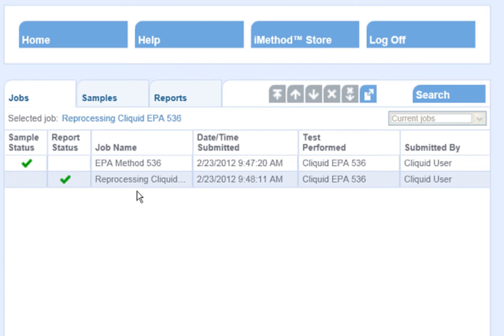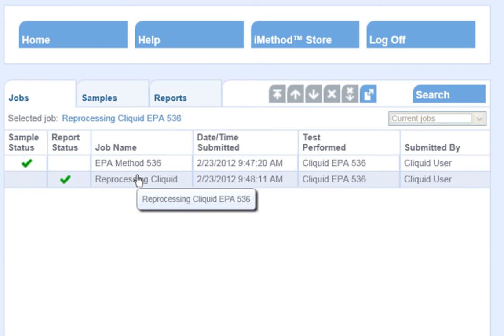Completed jobs and sample sets are seen on the right-hand side of the screen.